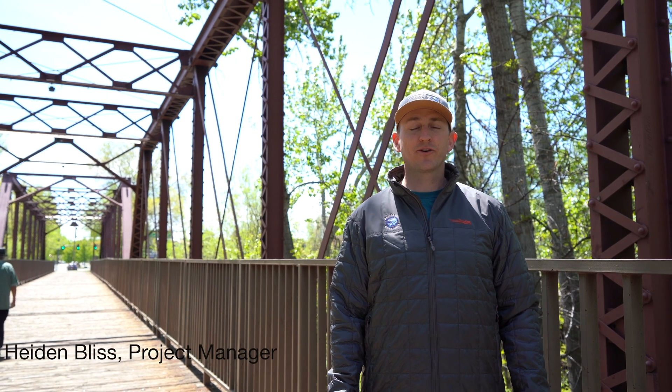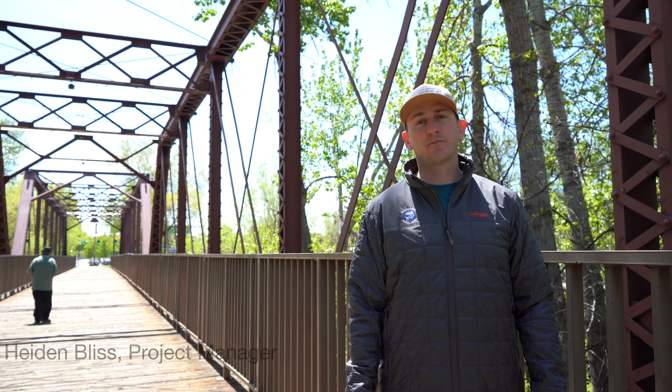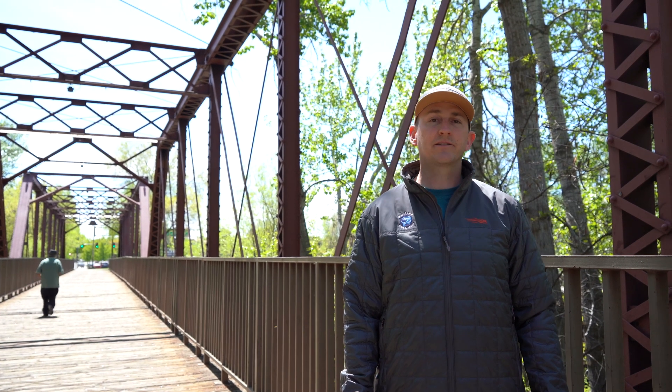My name is Hayden Bliss. I'm the Project and Europe Sales Manager here at Biomark. Today I'm going to talk about the new data collection module and some of the peripherals you can add to the system.